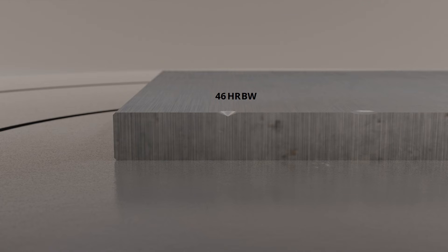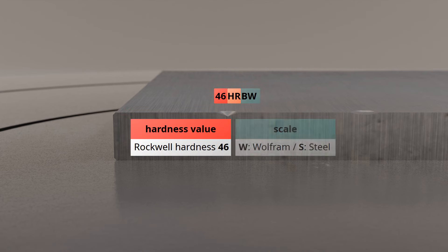The standard compliant indication of Rockwell hardness consists of the hardness value and the corresponding scale. When spherical indenters are used, it is also necessary to specify the material of the ball. Today, cemented carbide balls made of tungsten are almost exclusively used, designated with the letter W for Wolfram. In the past, steel balls were also used, identified with the letter S.